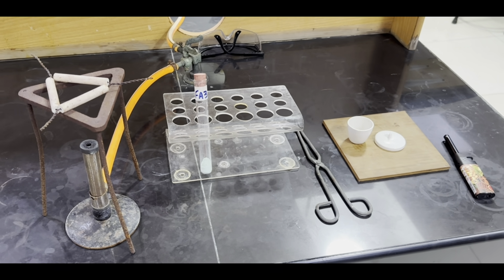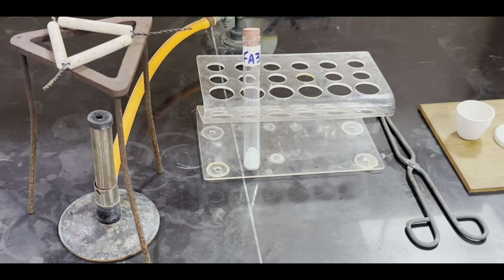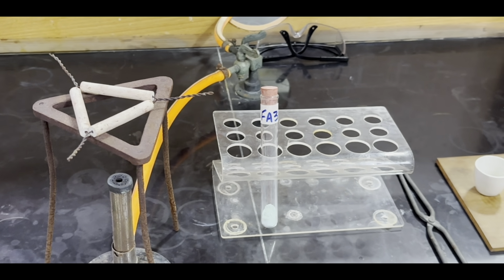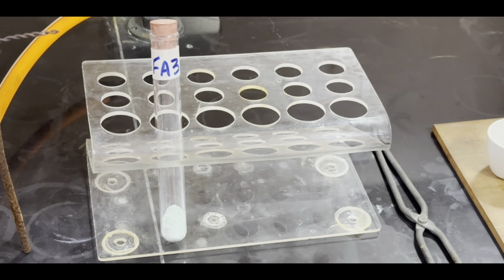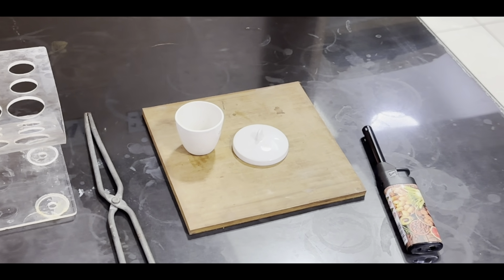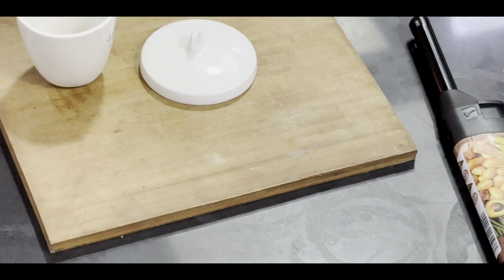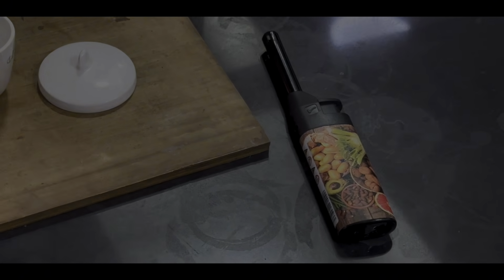Apparatus and chemicals given are a burner with a tripod stand and a pipe clay triangle with green crystalline solid in a test tube, a pair of tongs and a crucible with lid on a heat-proof mat, then a lighter.